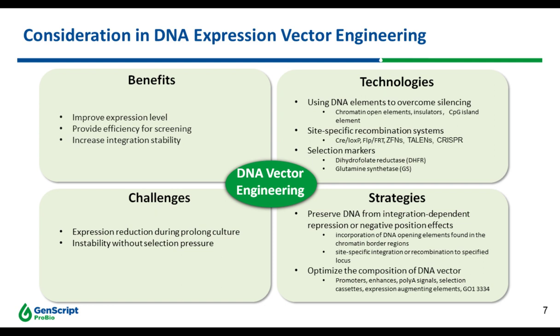Okay. Next are the considerations in DNA expression vector engineering, their benefits and challenges. The challenge is to maintain the expression during prolonged culture, and also to avoid instability without selection pressure.